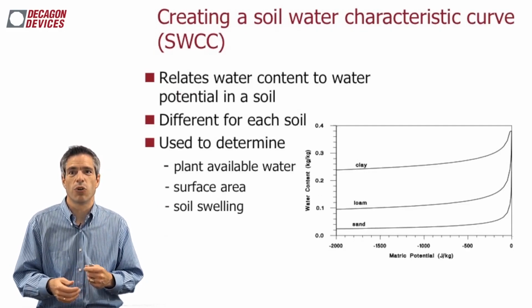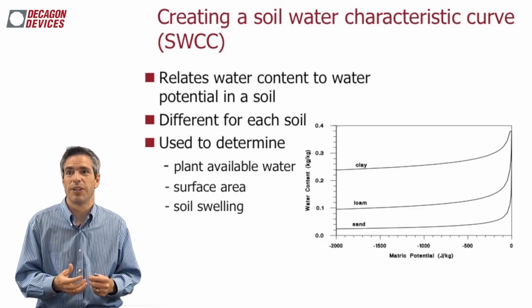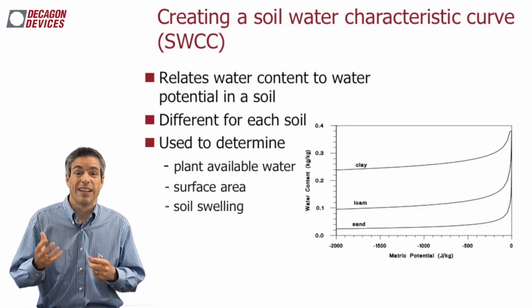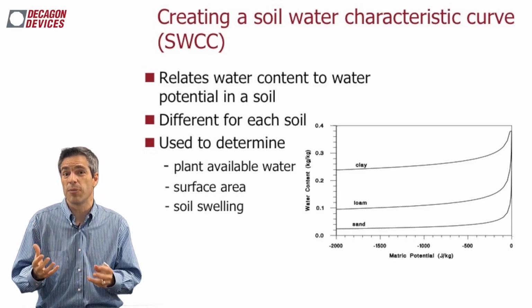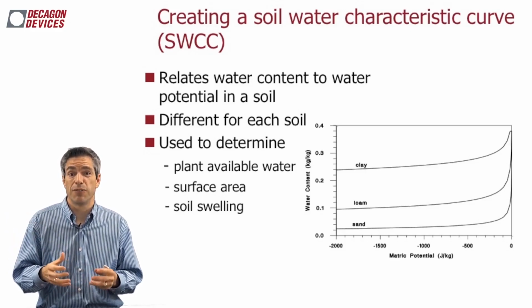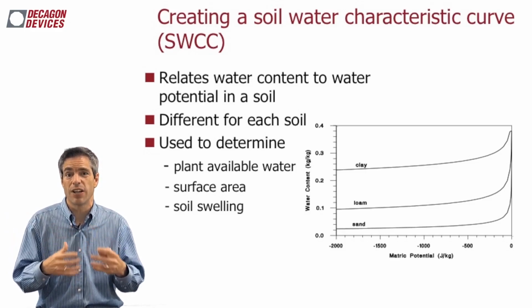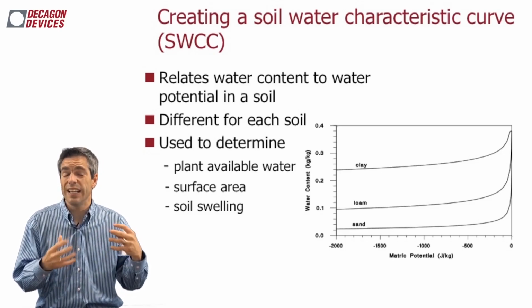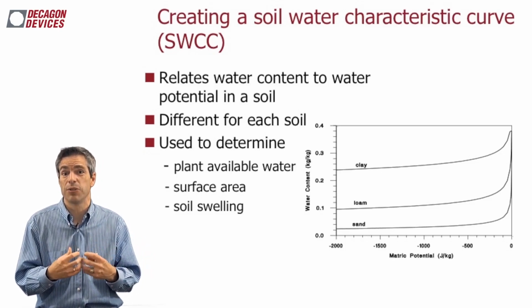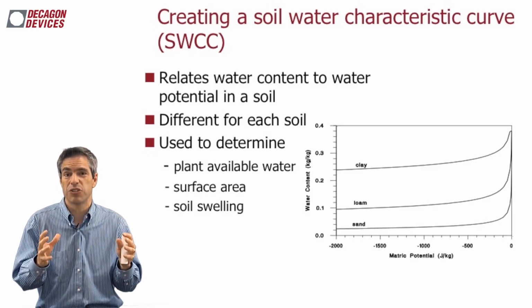So let's jump in. The soil water characteristic curve, or SWCC. Doug talked quite a bit about this in his web seminar just a few weeks back, and I'm not going to try to dive into this too much again. I just want to preface our discussion because he didn't talk about how to measure it, and I'm going to do that. So let's just recall what this was.